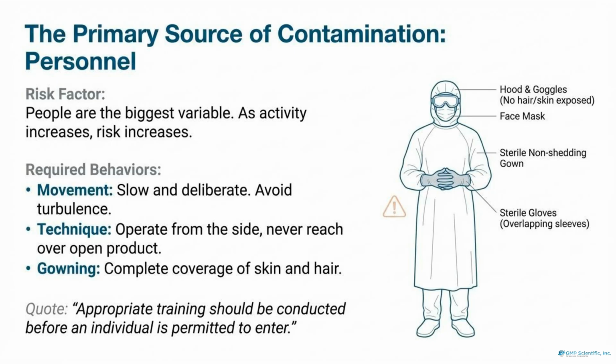Personnel are the greatest variable and the largest source of contamination. Movement must be slow and deliberate to avoid air turbulence. Proper technique is vital. Never reach over open product. Full gowning is required, ensuring no hair or skin is exposed.